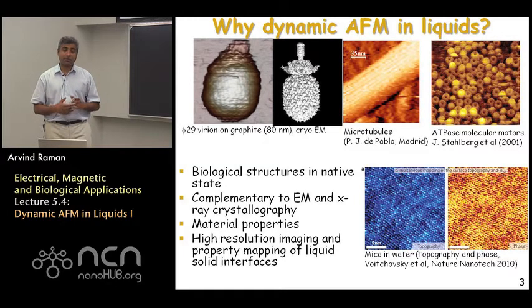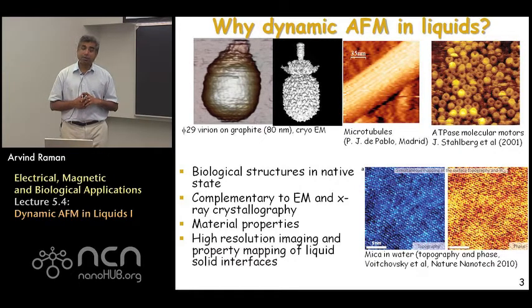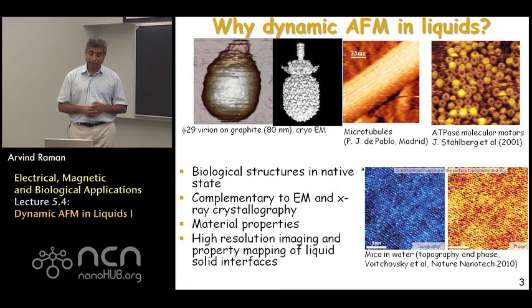The second important thing is that when you're imaging in liquids under ambient temperature conditions, many of these proteins that we're looking at are not frozen. They're actually moving around. They're floppy, and the AFM picks up on the flexibility of these molecules as well, which is a pretty realistic situation. On the top row in the middle, you see an image of a microtubule in liquid media and in aqueous solutions, and if you look carefully, you see the linear molecular structure of the chains of the polymeric molecules that make up the hollow tube-like structure that's found within many eukaryotic cells. On the top right, you see images taken of molecular motors with very high resolution.